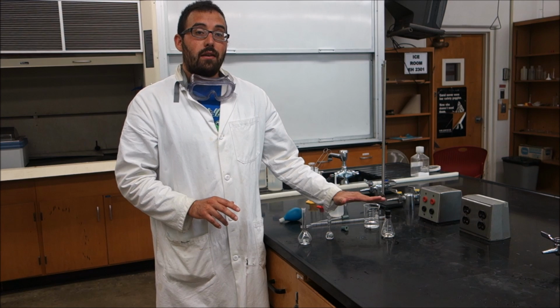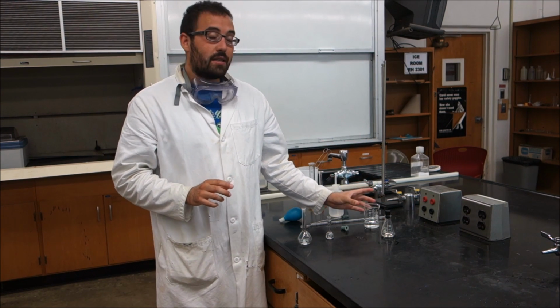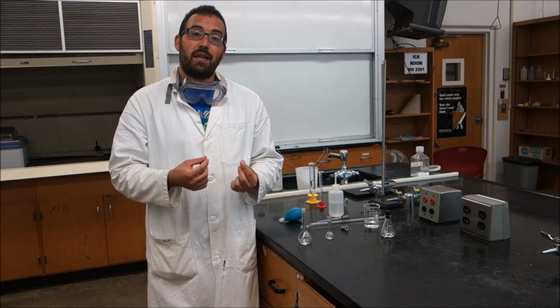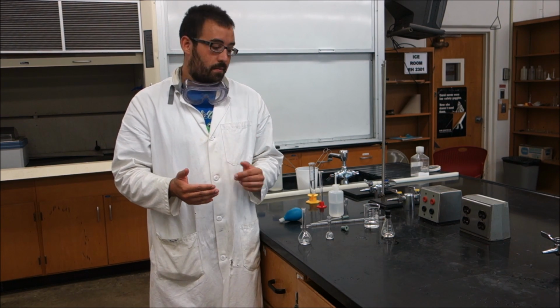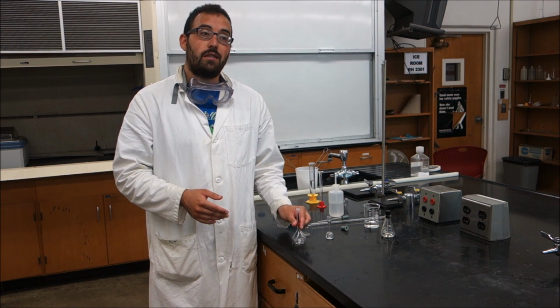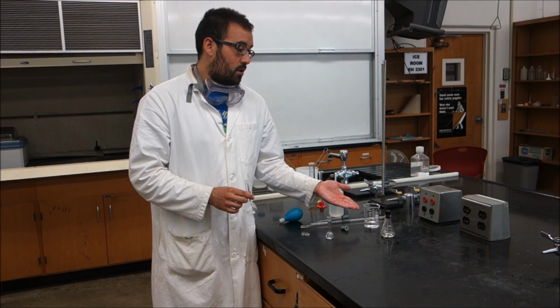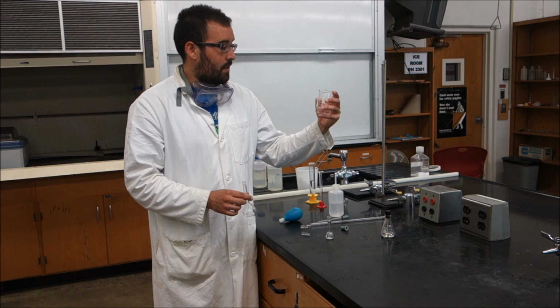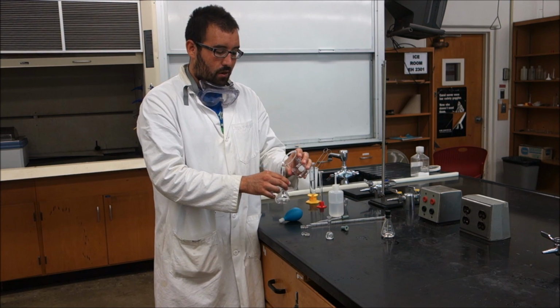Once you've made your standard series, what we're going to do is go ahead and dilute our penny that's been dissolved. So at the beginning of your lab, you'll throw a penny in nitric acid. It'll turn this really cool bluish green color. And then we'll transfer that into a 50 milliliter volumetric flask. Now, yours will be inside of a beaker, and it'll be about 35 milliliters. Now, this one is a little bit more than that, but we'll go ahead and transfer it over.